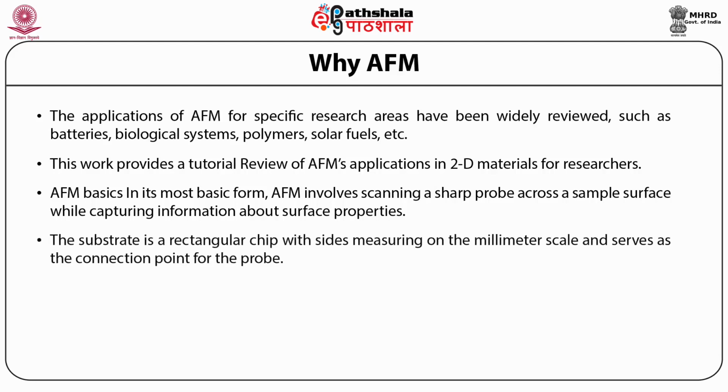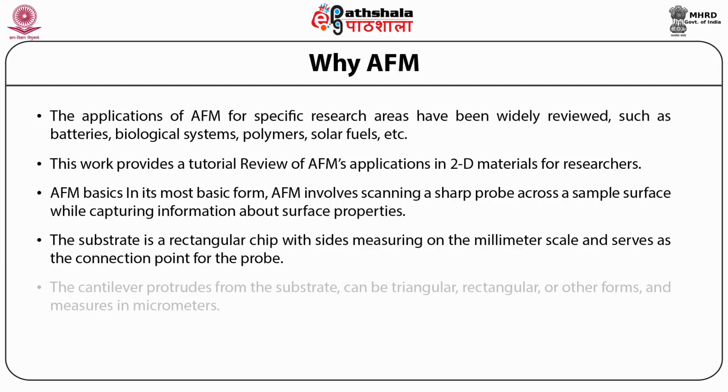The substrate is a rectangular chip with sides measuring on a millimeter scale and serves as connection point for the probe. The cantilever protrudes from the substrate, can be triangular, rectangular or other form, and measures in micrometers.